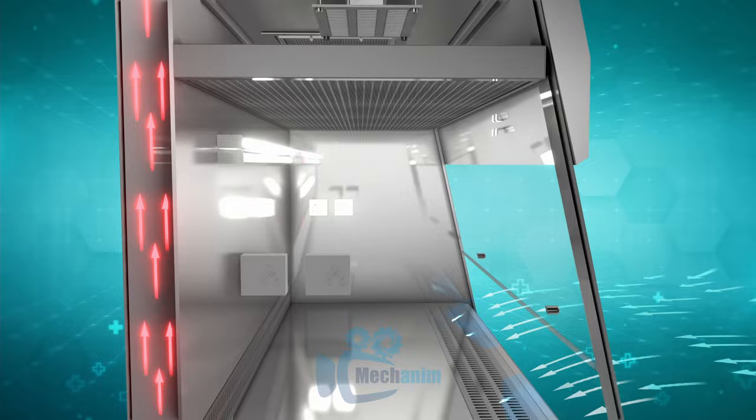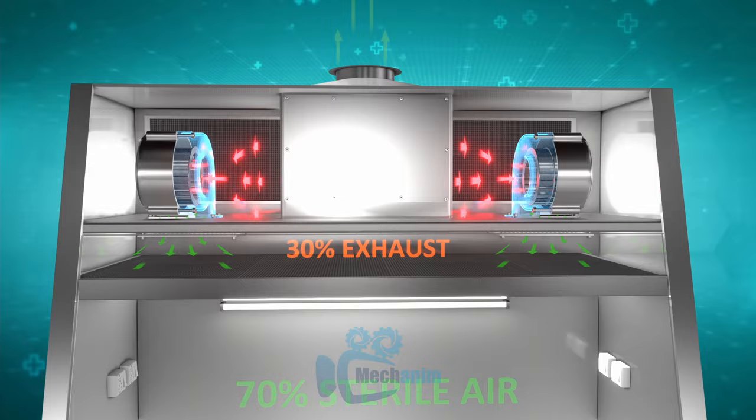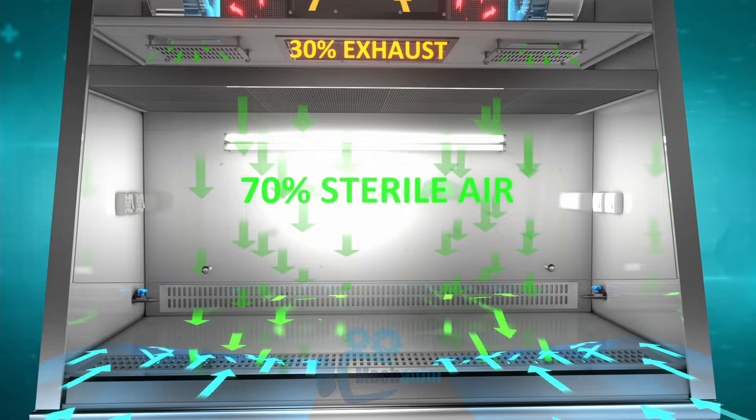Contaminated air is pushed through HEPA filters by the cabinet blower motor. Thirty percent of HEPA filtered air leaves the top of the cabinet and recirculates into the room, or is removed by canopy exhaust.